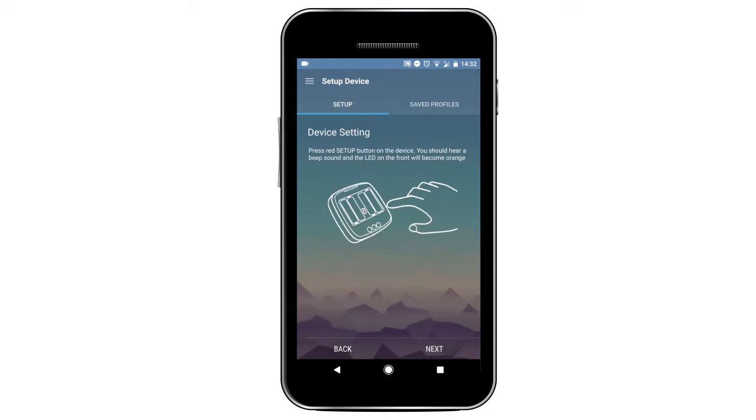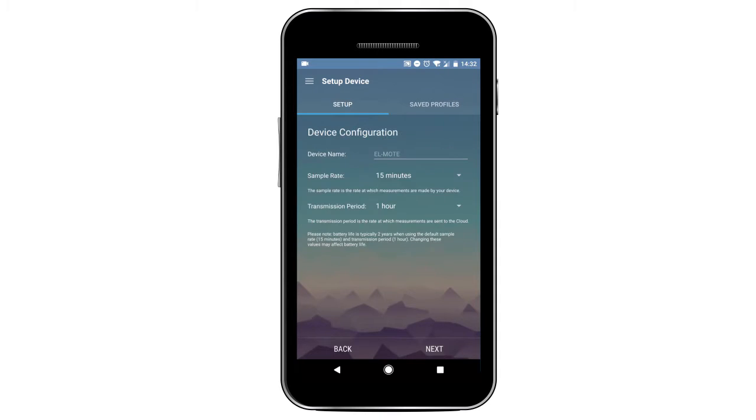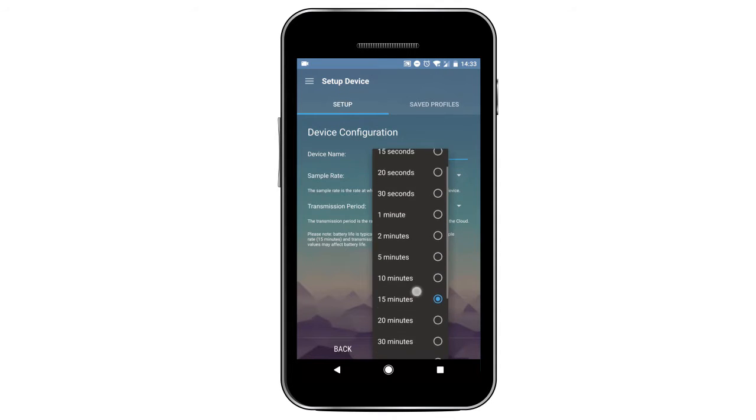For Wi-Fi, click the little red button in between the batteries at the back of the device and listen for a beep. The light on the front of the device should turn orange too. Click Next on your app and you will then be asked to name your device and choose your sample rate and transmission period.